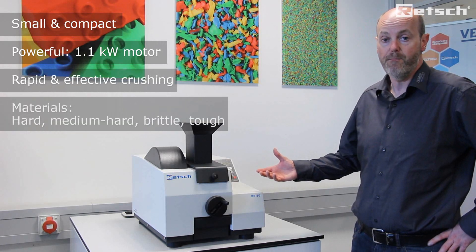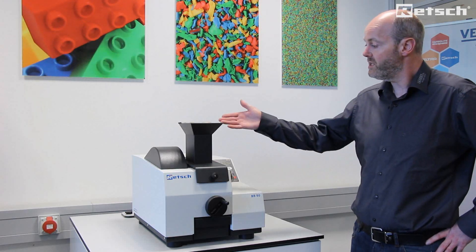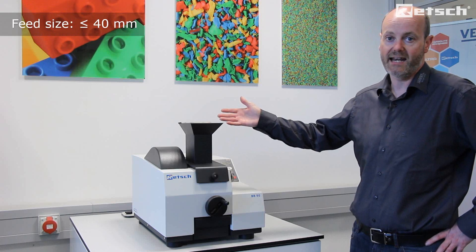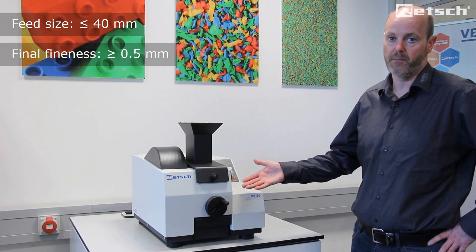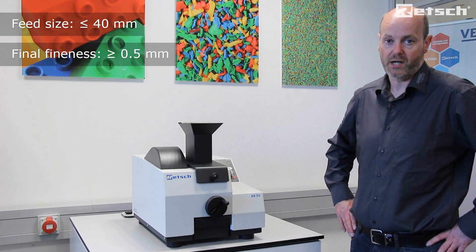It crushes hard, medium hard, brittle and tough materials. It can accept pieces as an initial feed size up to 40 millimetres in any dimension, and can crush down to 0.5 millimetres, offering a very wide particle size reduction ratio.